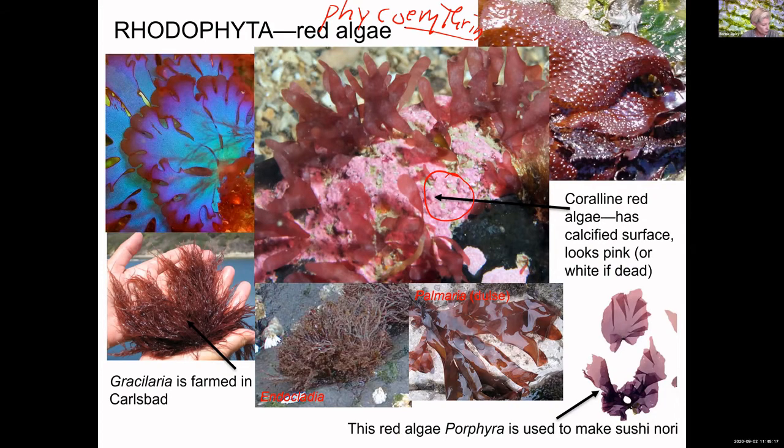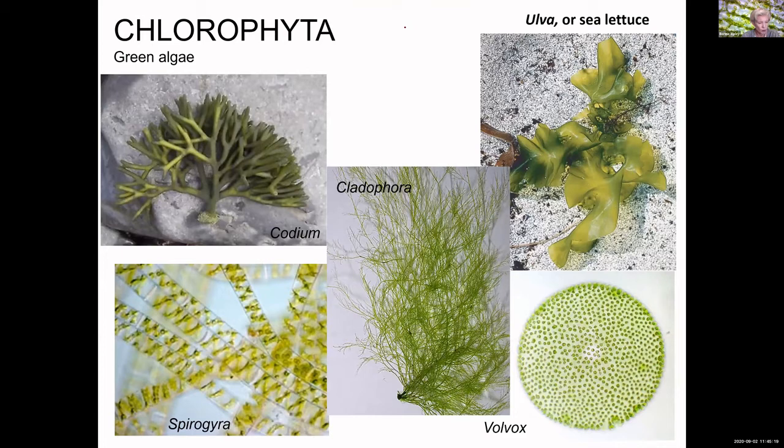The next group we're going to look at briefly are the chlorophyta, the green algae, and they aren't all as lovely and bright green as these examples are. But I'm not going to give you any tricky ones that look brown but are green. They take on different body forms, and we might notice that they have a leaf-like structure that's sort of flat and broad.